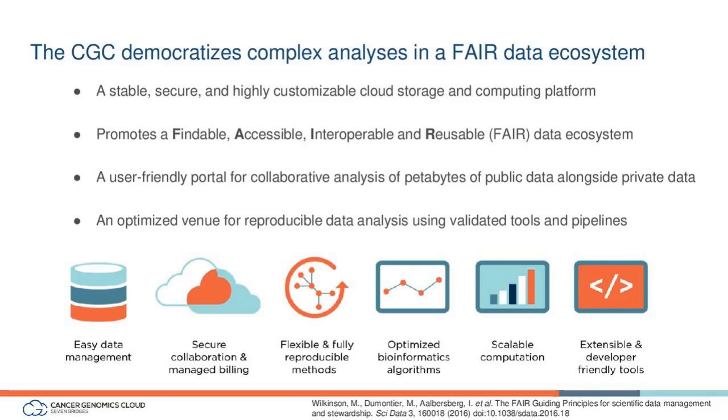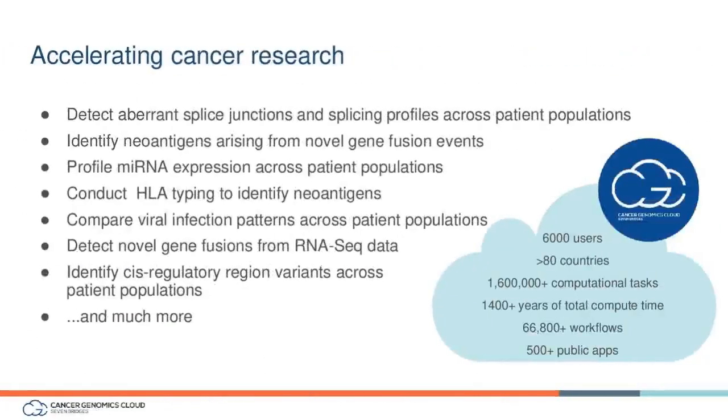And some of the features I'm going to talk about later include easy data management, very important secure collaboration and managed billing, as well as scalable compute and optimized and flexible bioinformatics. So keep those things in mind when we talk about the important components of the CGC.